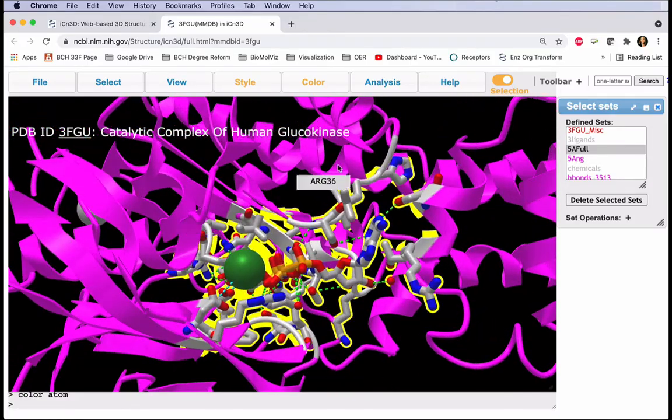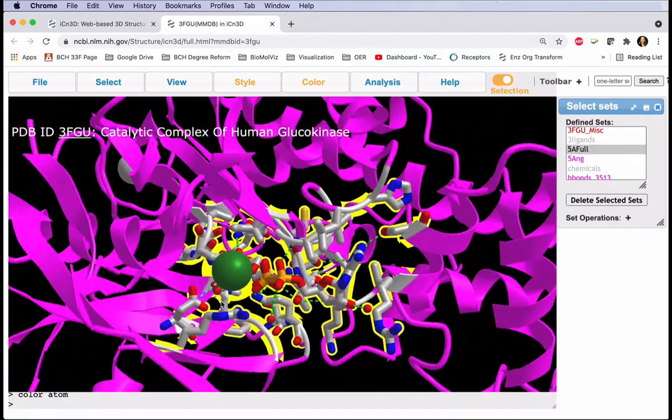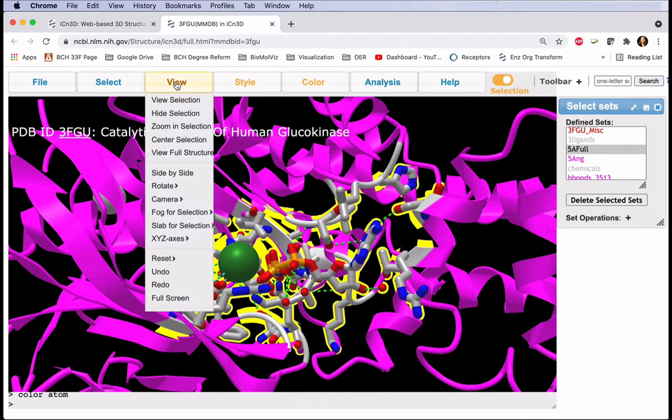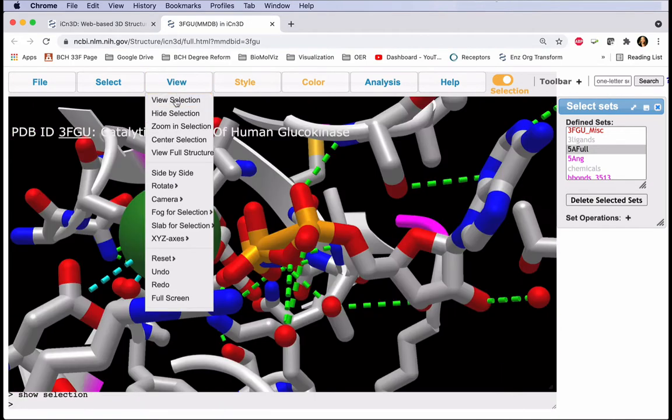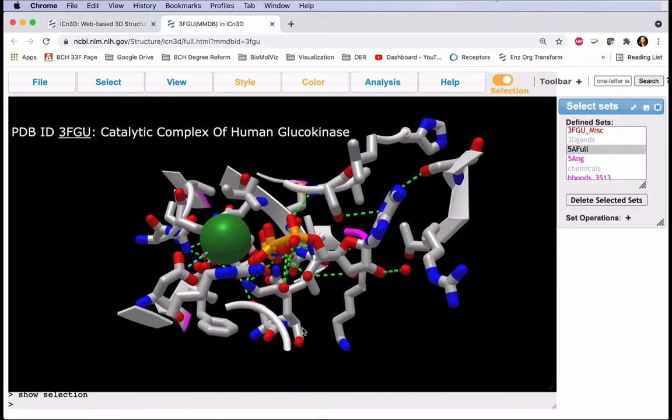It's nice to see our active site in the context of the protein. However, it makes the view busy and a little difficult to see. To focus on our selection, we can click View, View Selection. It zooms in, but now just the selection is shown. But parts of our protein are still shown in the cartoon representation.